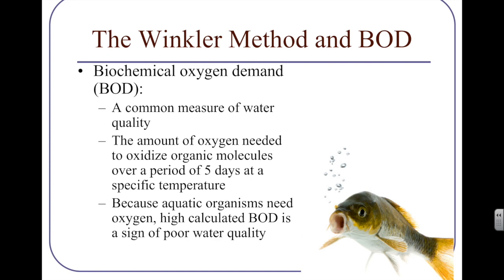It's a test that's run over 5 days. Okay, we basically take a sample of water and we saturate it with oxygen and let it sit there for 5 days. And the organisms that are in there are either going to consume the oxygen or produce more oxygen. Okay, and we do a titration after that.